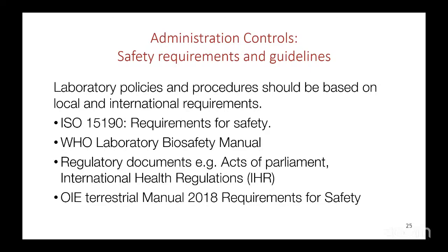For those who don't know much about ISO, ISO means International Organization for Standardization. ISO 15189 is for medical laboratory competency. ISO 15190 talks about requirements for safety. We have WHO laboratory safety manuals, regulatory documents such as Acts of Parliament and International Health Regulations. I think I have the Nigeria policy on safety. I think I will share that with us, etc.